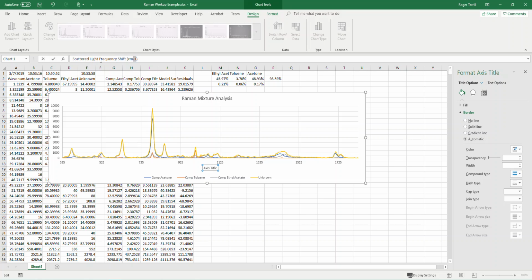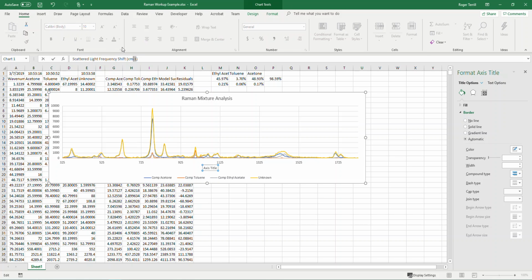Going to do a control 1 here. Oops, where is that? Okay, I'm not going to do control 1. I'm going to go home, font, oops. My control 1 dialog came up in a weird place, I think. Didn't know where you are, Mr. Control 1. Where are you?